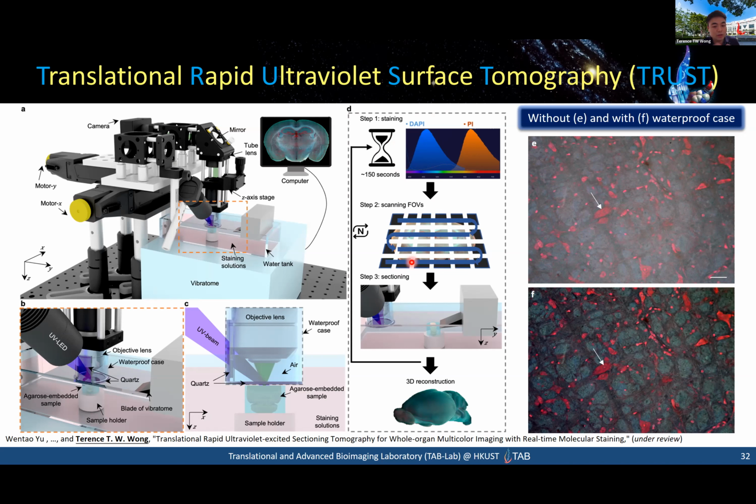In 3D histopathology, normally people do sectioning first, and then they image. So that's why the tissue is never intact. It's ruptured or has different orientations, or some sort of rotation problem. But if it's imaged first, when it's still intact, and then you shave it off, and then image another intact surface, you always have a very nice integrity or vitality of the entire tissue. So at the end, you don't need to do any registration of the image. You just stack them. You're really simply stacking them.